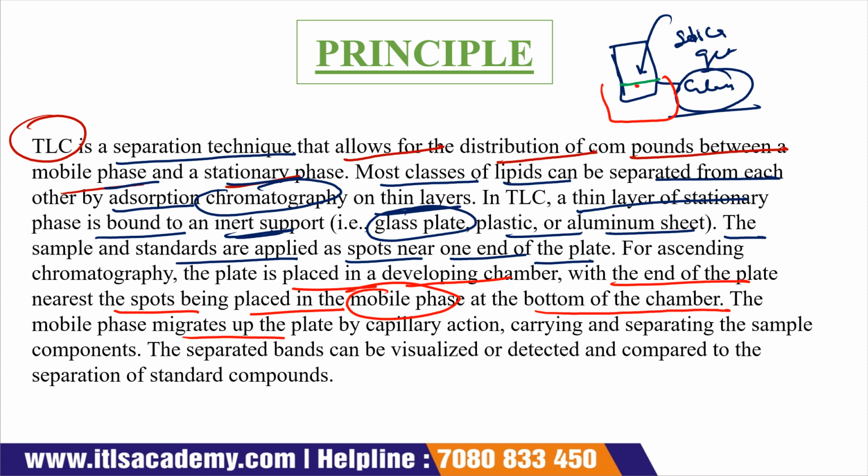The mobile phase migrates up the plate by capillary action. Now due to this capillary action, this mobile phase goes upward, carrying and separating the sample components. The separated bands can be visualized or detected and compared to the separation of standard compounds.